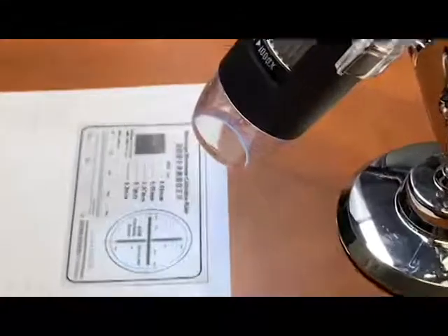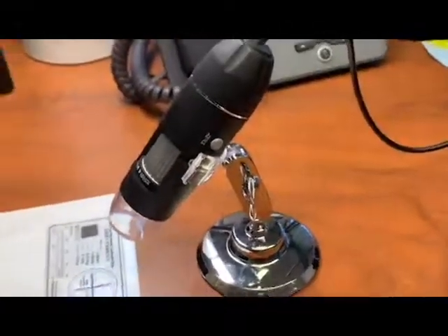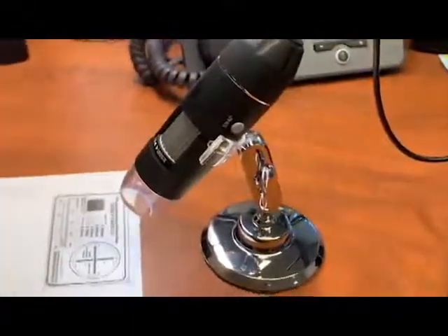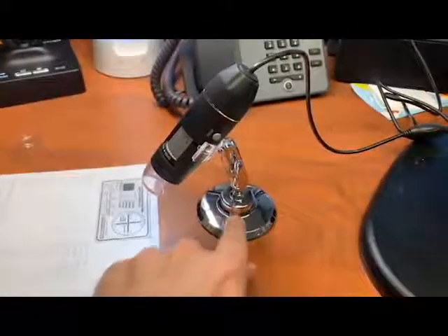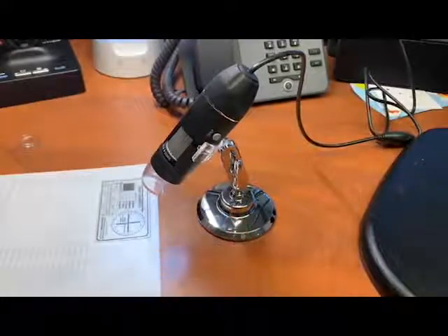I've got this card here that comes in the pack, just to show how it works. This camera hooks up USB, and it does have a little light switch right there. But I found that with this particular scope being a little bit lighter weight, I have to hold the base when I use it, otherwise the cable will move it, as you can see. So I'm going to attach a video where you can actually see what the image looks like.